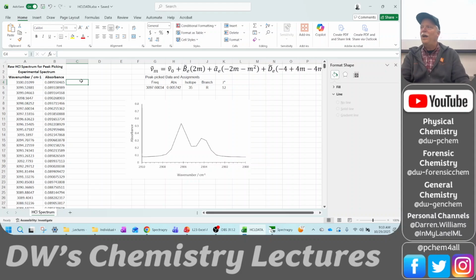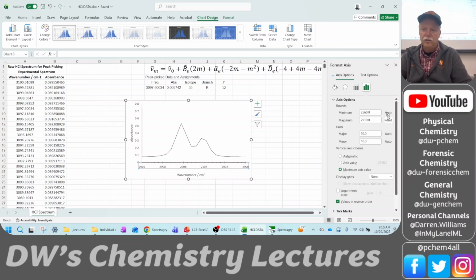Okay, and there's no way to copy that number and paste it over there because you're just hovering with the mouse and seeing the number. So don't do it that way. What we want to do is come over here and find the maximum absorbance value and pull the frequency over. There's a lot of ways to do that. Let me go back here and reset those two limits.